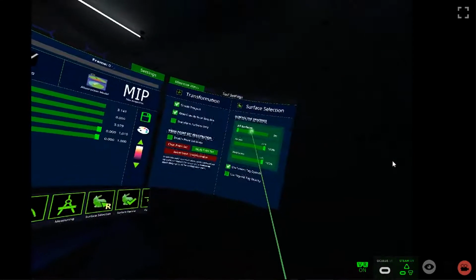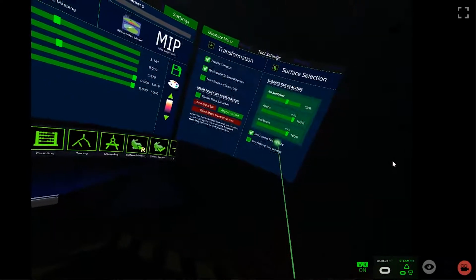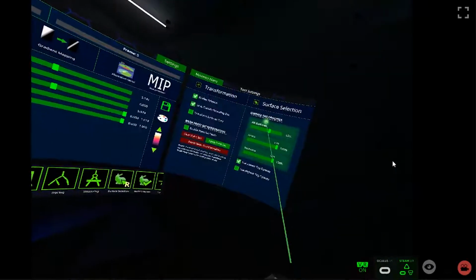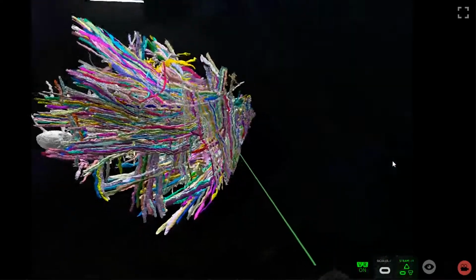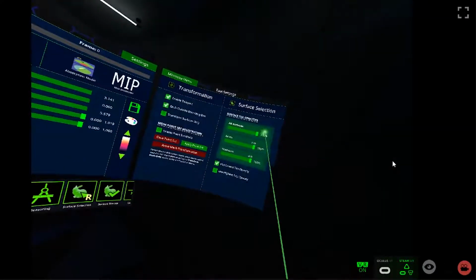So there are two check marks right here, lowest tag opacity and highest tag opacity. This will just select whichever, if you have multiple labels, so here all surfaces applies to all of them. If I pick this, they should all become solid now. Okay, and that looks good. So I'll bring that up to 100%.